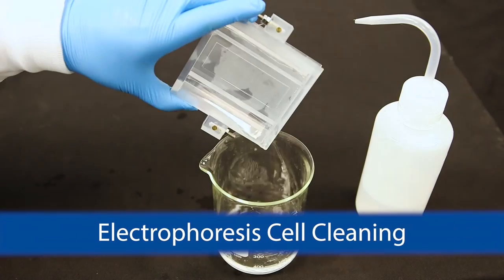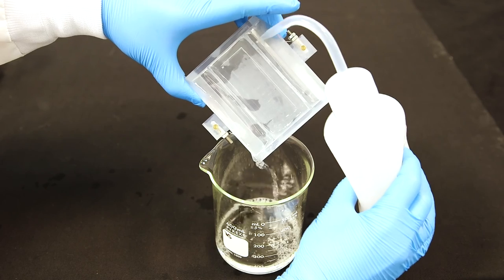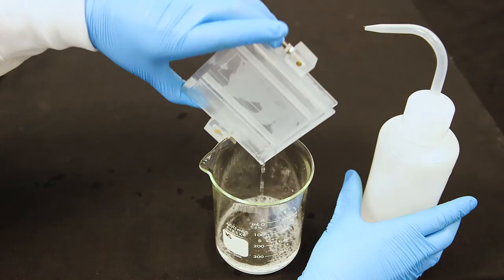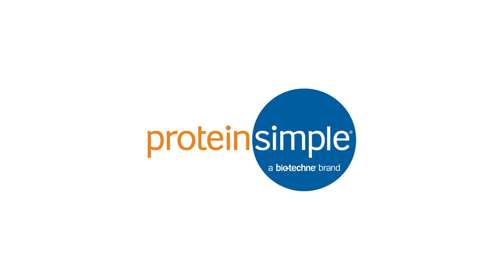You're almost done. Now just pour your buffer into a waste container and wash with water before running your next chip or storing it. To learn more, consult the Milo User Guide.